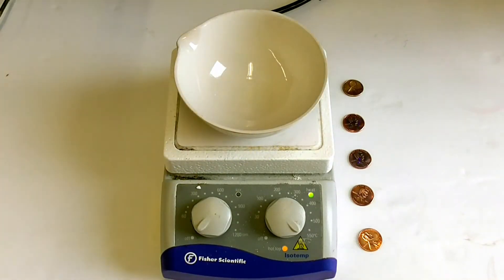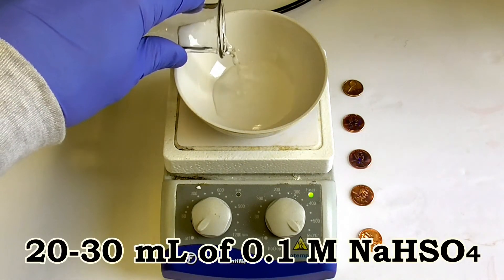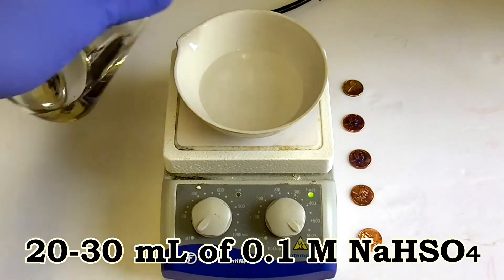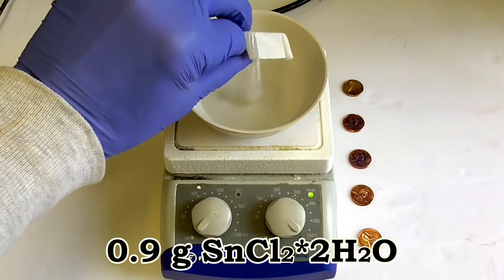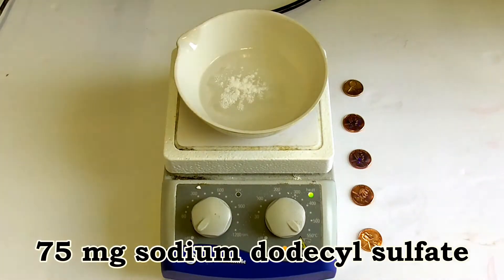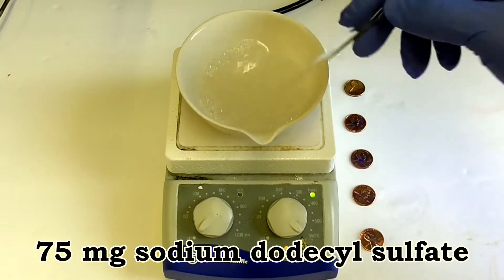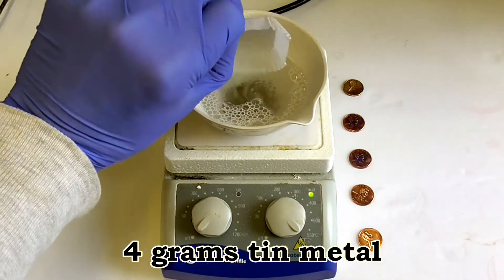To set up the experiment, you'll first need to add about 20 to 30 milliliters of 0.1 molar sodium hydrogen sulfate solution to an evaporating dish. Next, add 0.9 grams of tin 2-chloride dihydrate. It's helpful to add some sodium dodecyl sulfate, about 75 milligrams here, but this step is optional. Next, add 4 grams of granular tin.